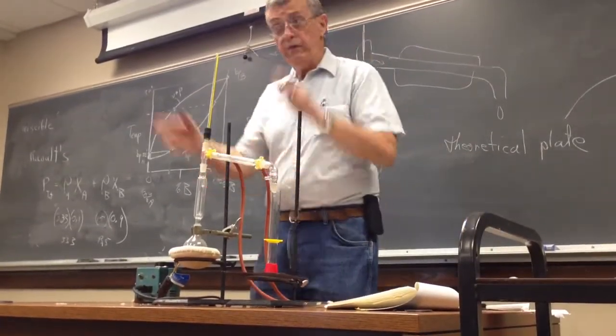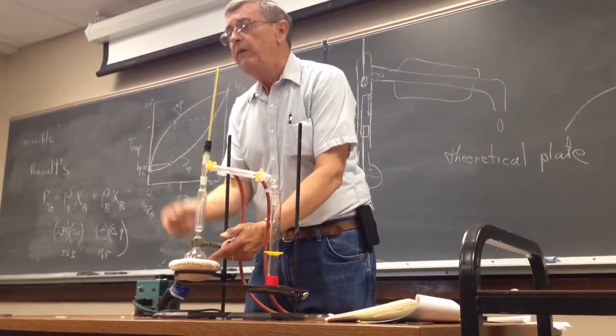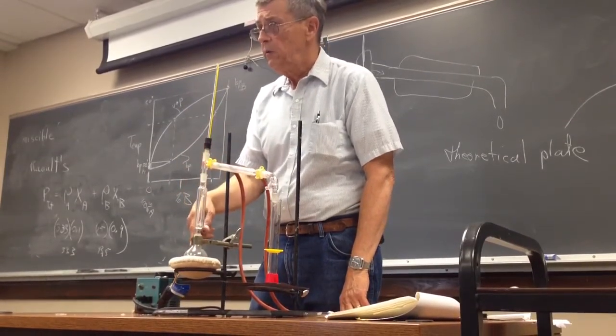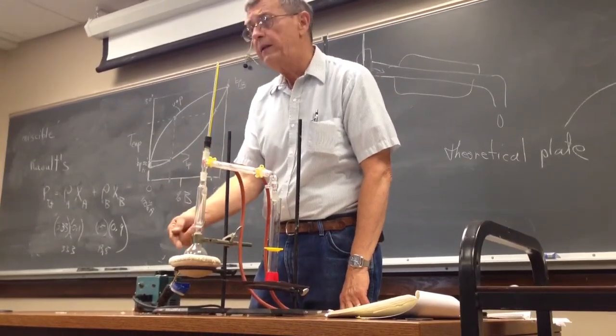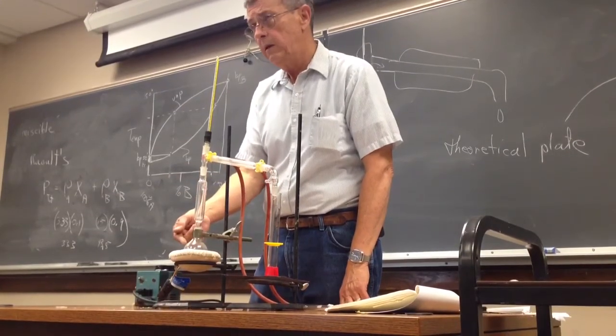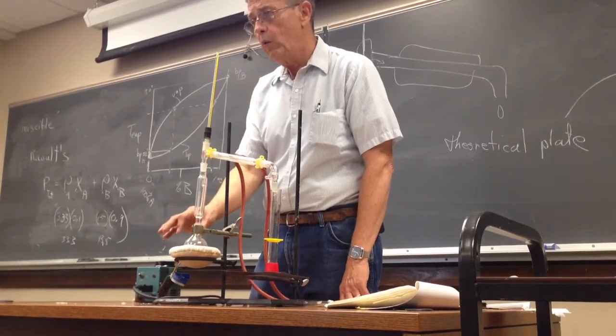When you finish, if you add all that up, you're still going to have about 10 mils in here. That's so that we don't distill this to dryness. Because if you do that, 1, you could burn out the mantle. 2, you could blow up the apparatus if oxygen goes back in. So you'll have almost 10 mils left in here when you are finished.